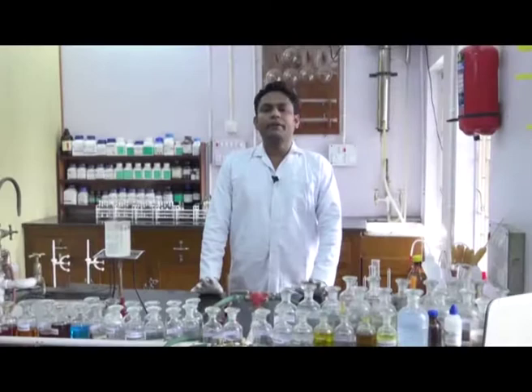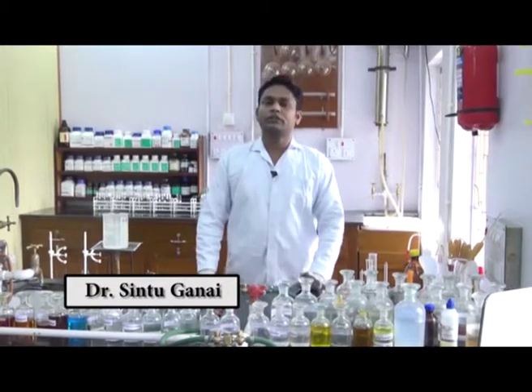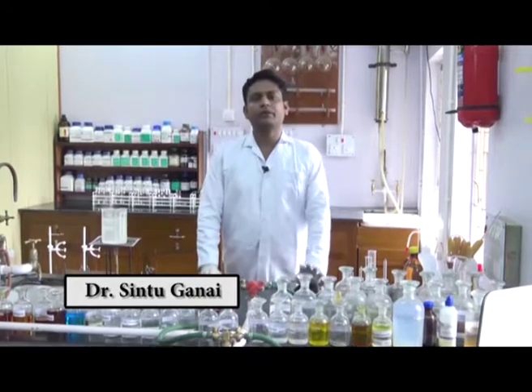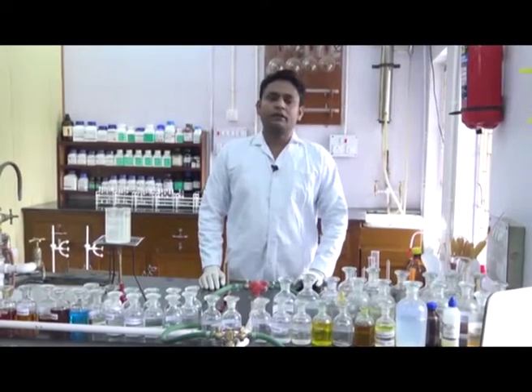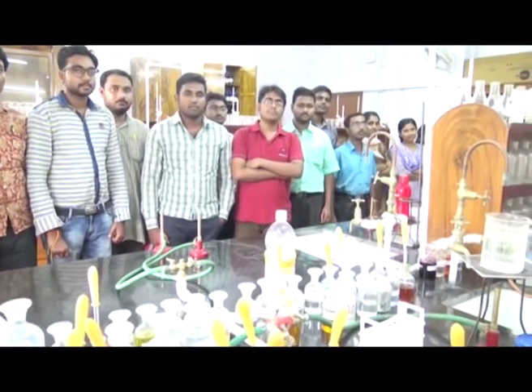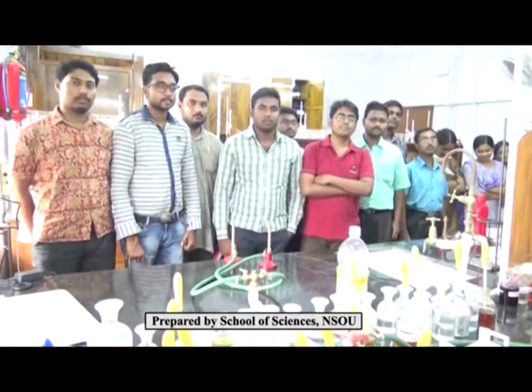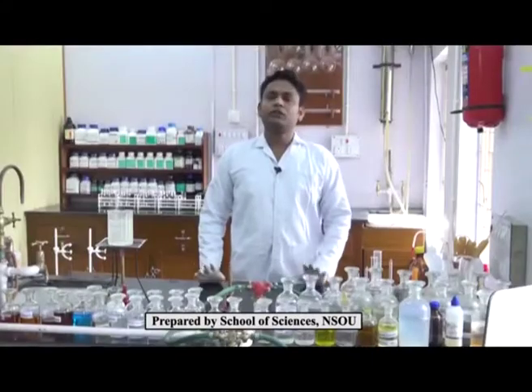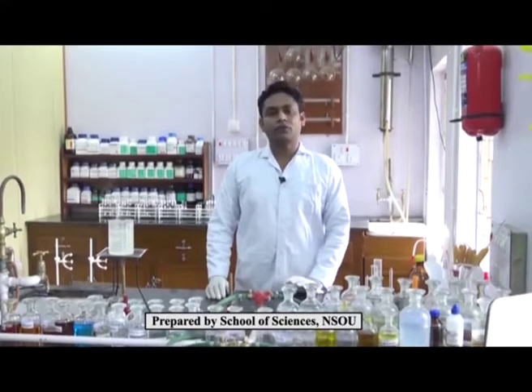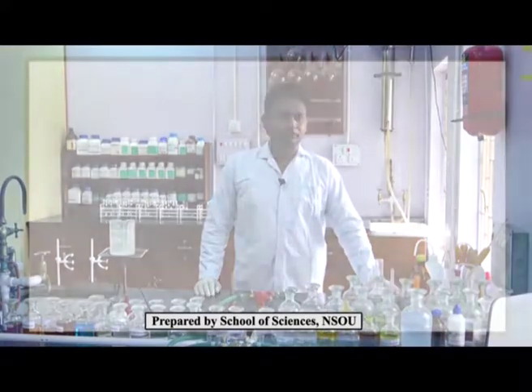Dear students, on behalf of Netaji Subhash Open University, we are going to demonstrate some laboratory practical reactions which will show the reactions involved in your classes. The demonstration is divided in two parts. In the first part, we will demonstrate the qualitative analysis of organic compounds, which will help to identify the organic compounds that will be delivered to your laboratory classes.